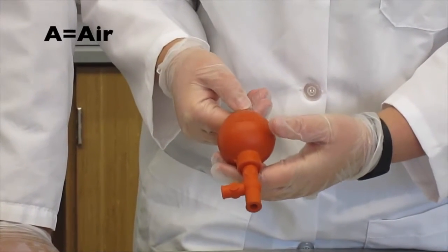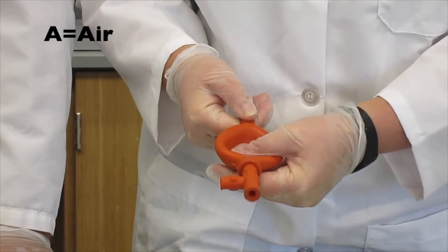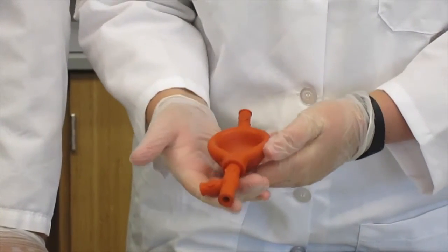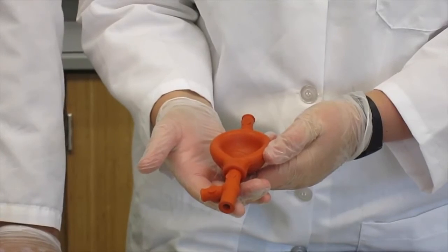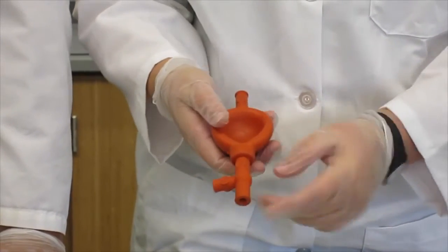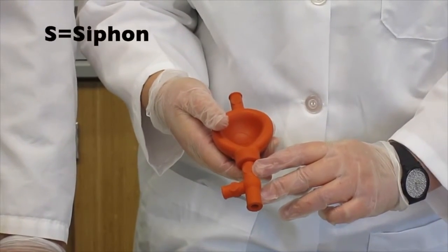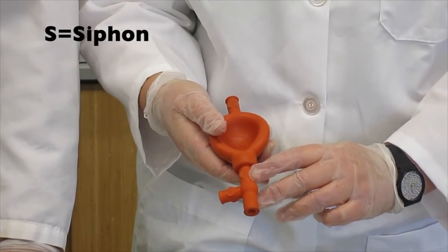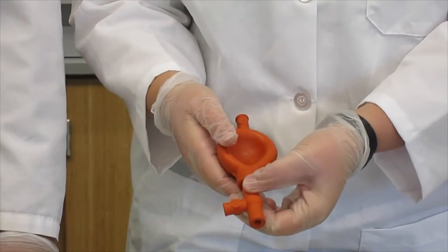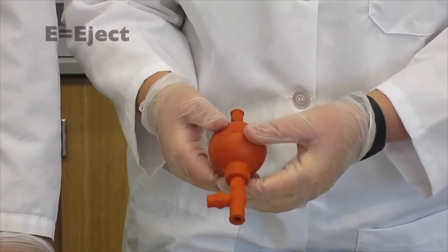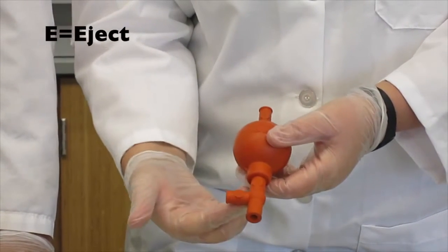The first valve to use is the A valve on the top. The A is for air because this valve allows air to release from the bulb to begin pipetting. Next, the S valve below the bulb is for siphon, which brings liquid into the pipette. The E valve on the side is for eject, releasing the liquid into a new container.